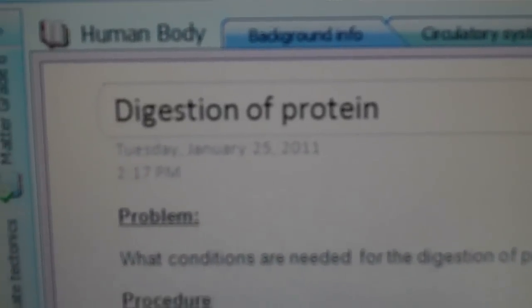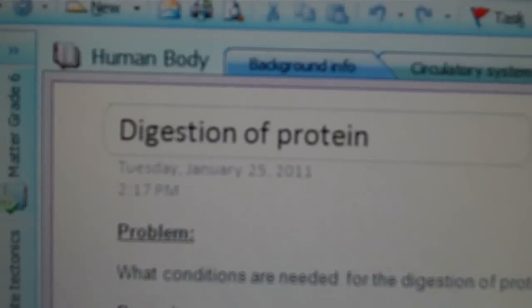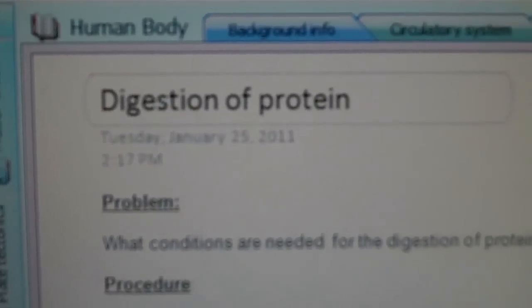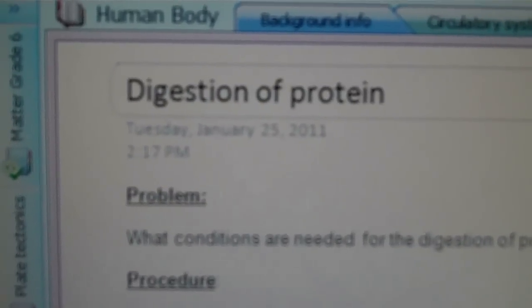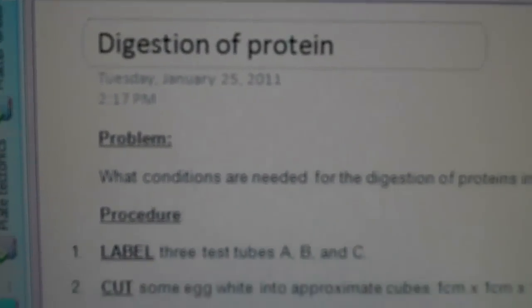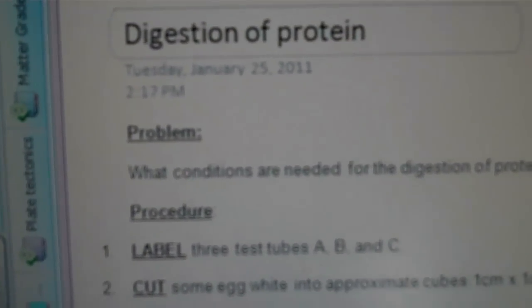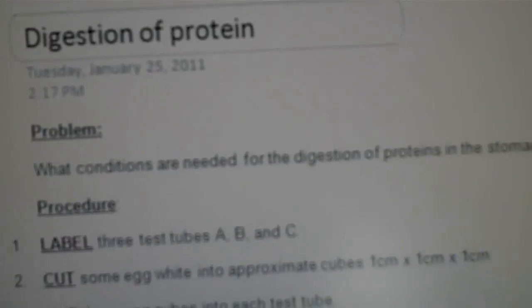Okay, we're going to do a digestion of protein experiment. This experiment we're going to be looking at digestion of the protein egg white, and what conditions are needed for the digestion of protein in the stomach.